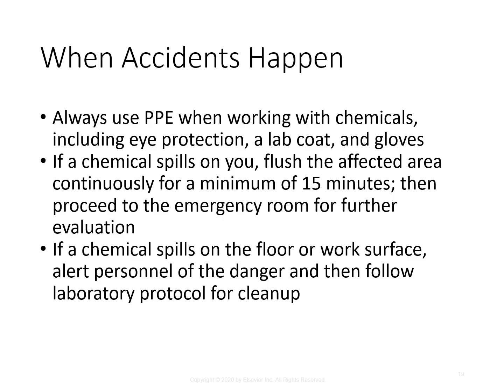If the chemical spills on the floor or work surface, you also need to alert personnel of the danger and then follow that laboratory protocol for cleanup. It may seem simple: you spill something, you're just going to get a napkin and clean it up. That is not always the case. Make sure you consult the SDS on how you should be cleaning those up. Some really do only need a napkin, but others will need special powders to help neutralize whatever you're working with, and some others have other things that are needed as well. So make sure you follow that protocol.